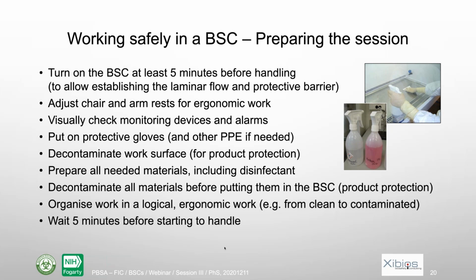Then you should make sure that you will work in a comfortable position. That means you should adjust your chair, the armrest, and so on. You should check the monitoring devices, alarms, and so on to see if everything is correct. And of course, put on the protection that you need, basically gloves, but you should be protected according to the risk and the procedures in place.